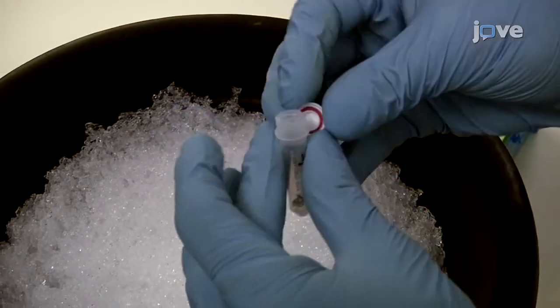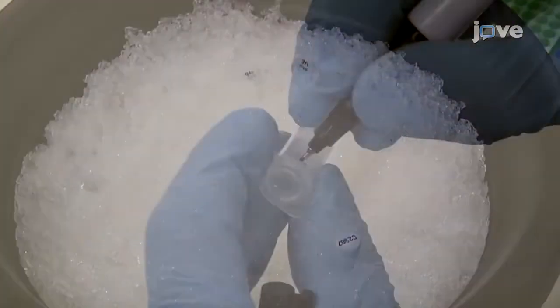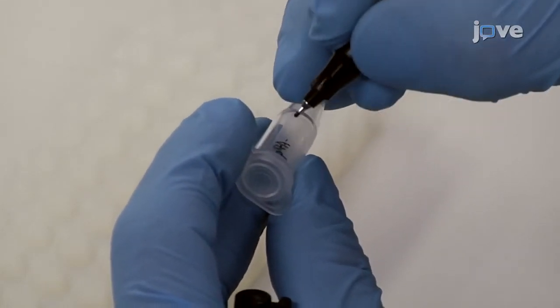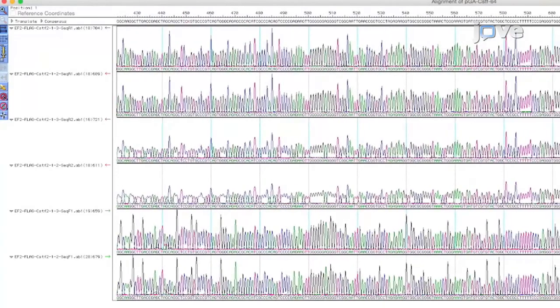Finally, confirm the DNA cloning success by DNA sequencing using specific or standard primers. Analyze the sequencing data for accuracy.